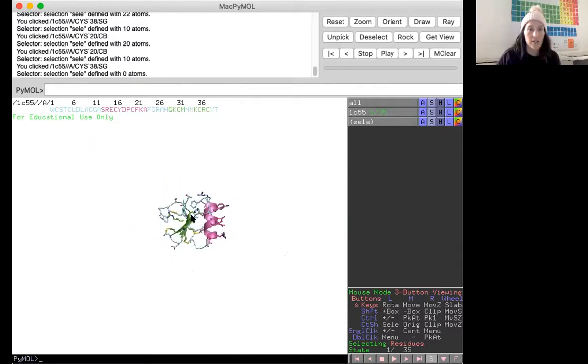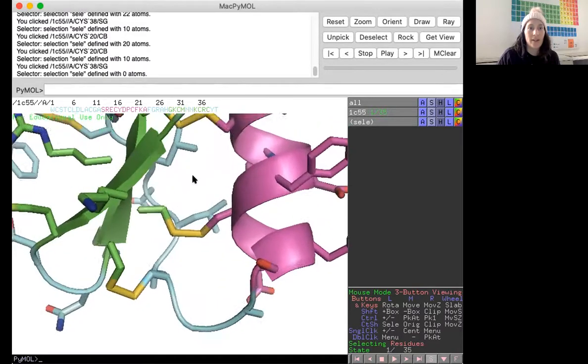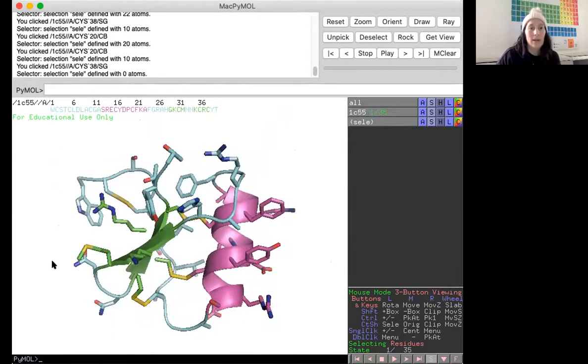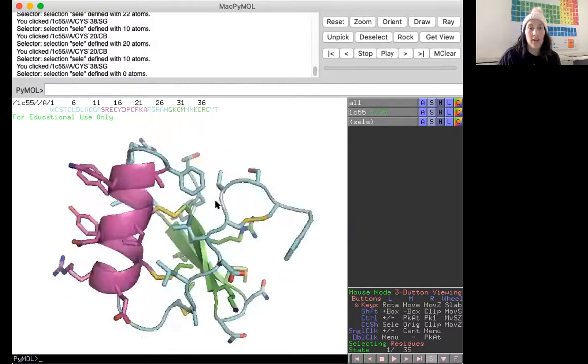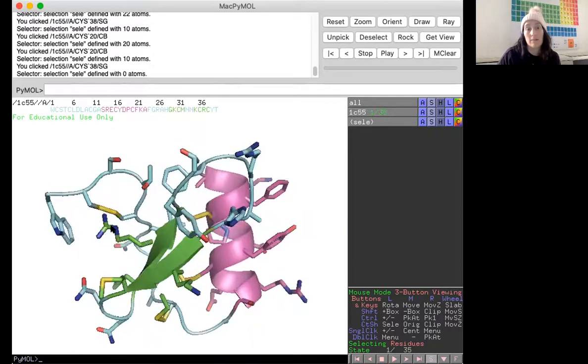Okay, so I can zoom in with the right button and I'm like, oh, I need to move that down. So I traverse it. Now I zoom out a little bit. Maybe I rotate it, right? You want to try to fill up this space, or also maybe show off whatever it is that I'm asking you in the image to show me.